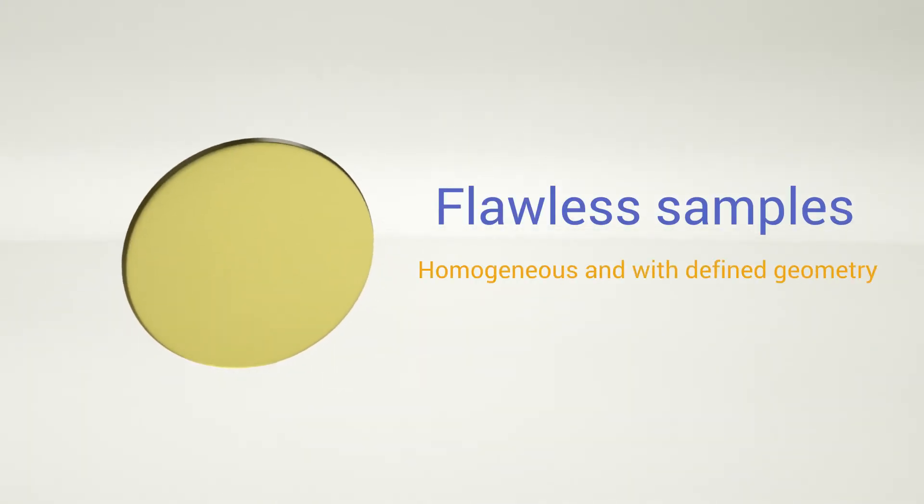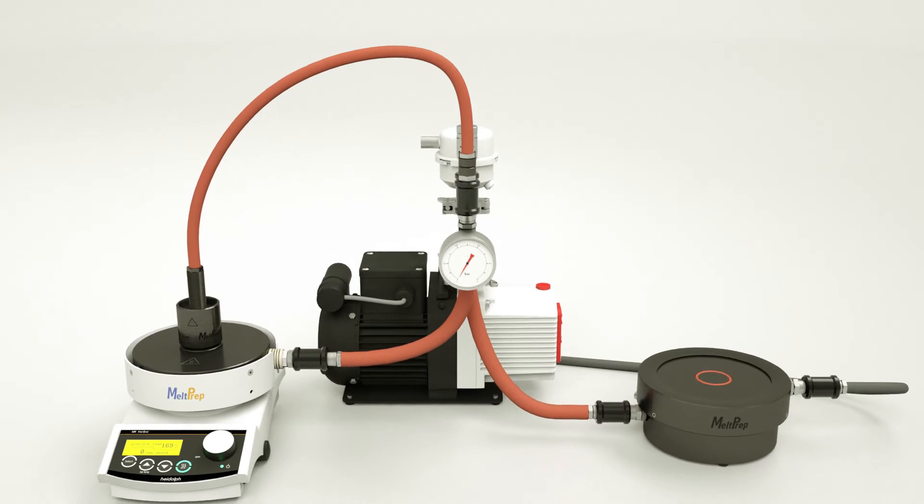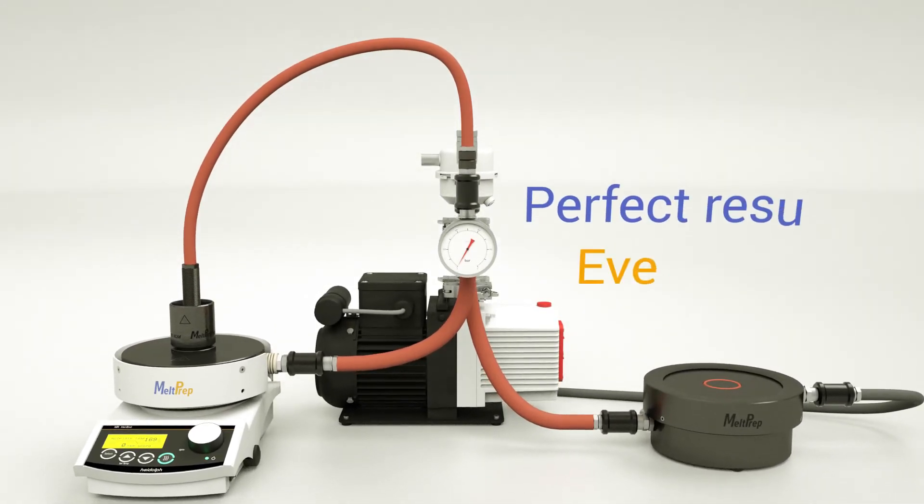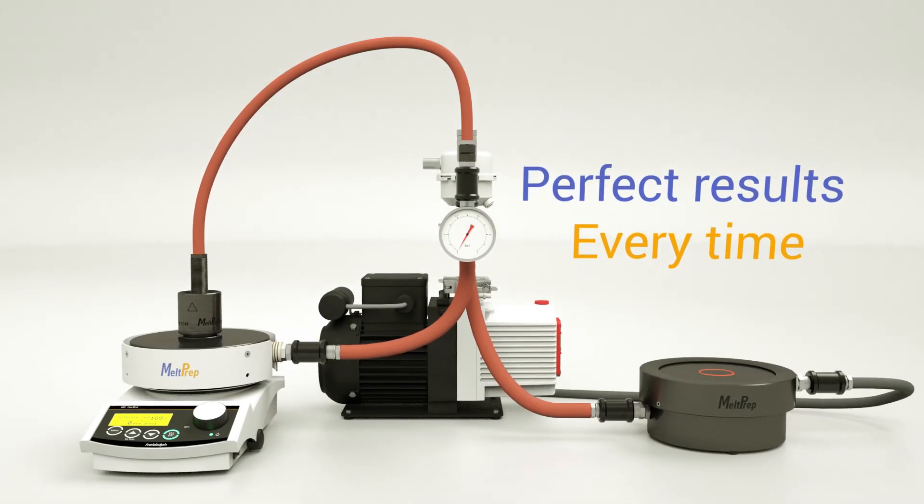The result is a homogenous sample with a precisely defined geometry, produced in about 10 minutes. Traditional molding methods usually demand more than an hour of your time. Meltprep VCM delivers perfect results in minutes, every time.